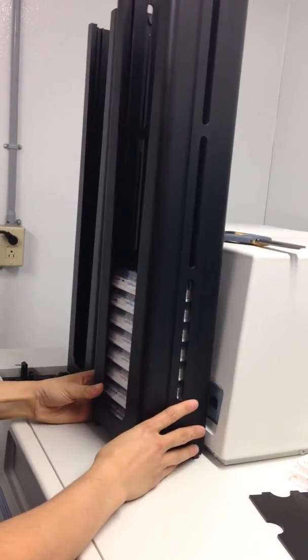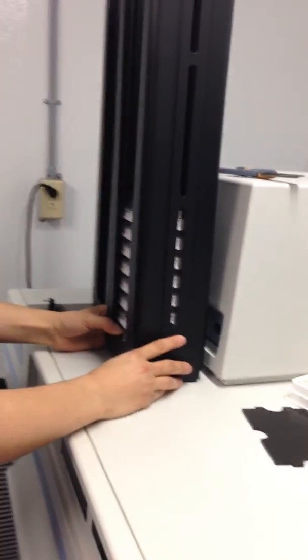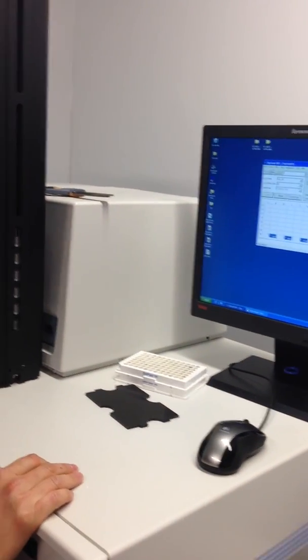Okay, so now that this is ready, we have to wait until the calibration is done. So I think you can pause now.